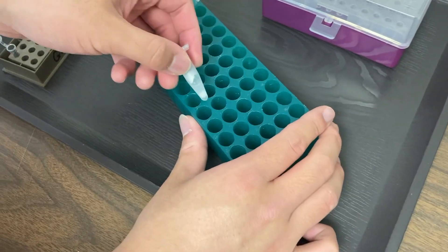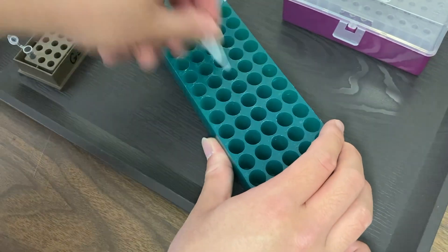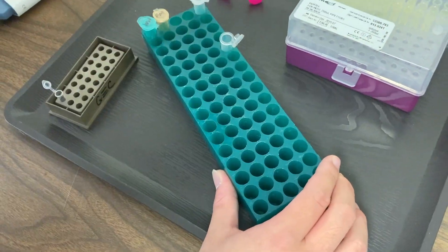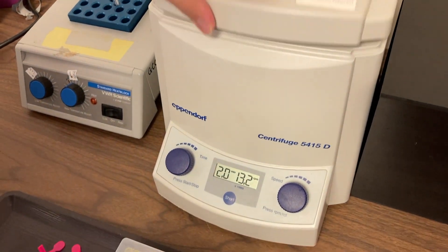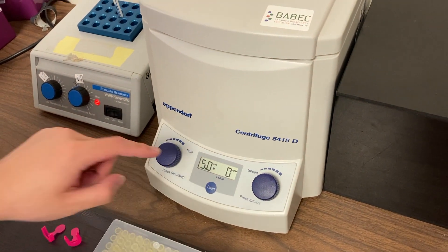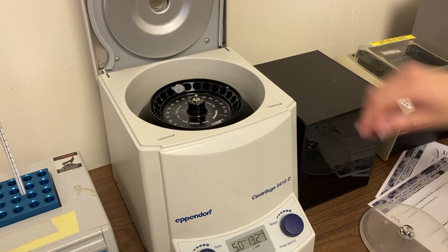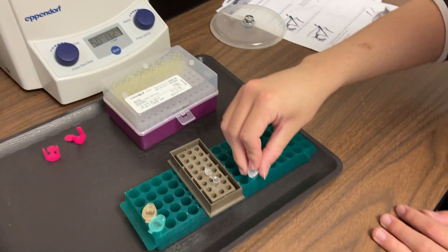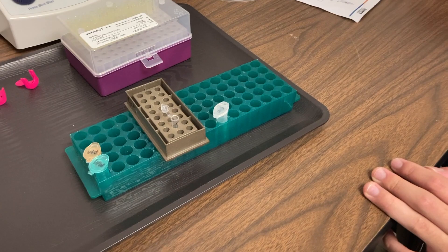After 10 minutes in the heat block, we're going to rack the contents of our microtube again to mix it up really well, then head back to the centrifuge. We're still going to spin it at over 13,000 RPMs, but this time we'll run it for five minutes. This spin is really the last step in DNA extraction — our DNA is now ready to move on to PCR.